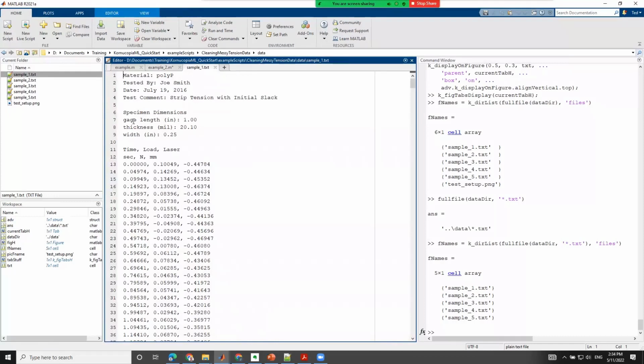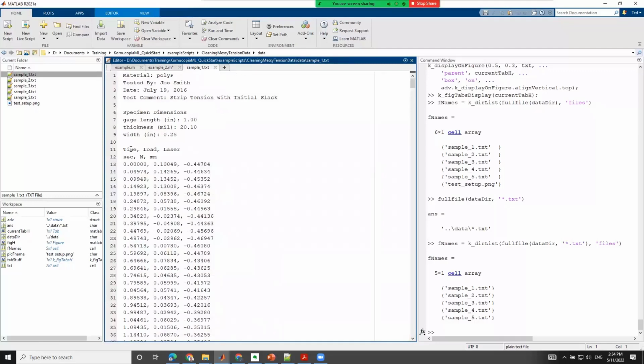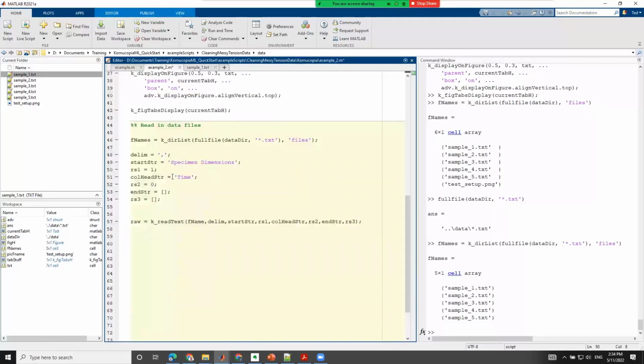We find that we want to step there, and there's where we want to collect. So this setting at 1 is okay. For our column headers, time is good. I don't see time anywhere else, so that'll be unique to search for. If I saw time elsewhere, then I would put in maybe time, comma, space, load. That's unlikely to be found anywhere, and I would have put that for this argument. But since time is uniquely found, that's fine.